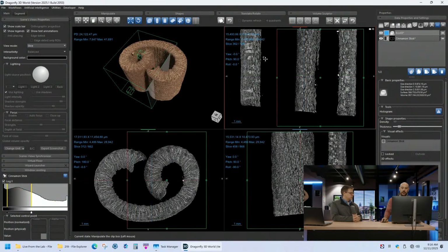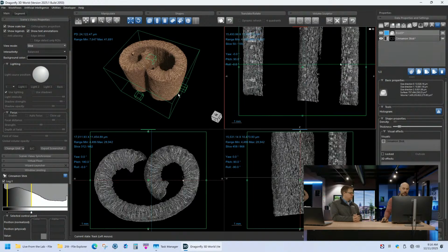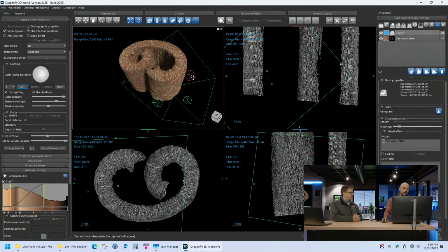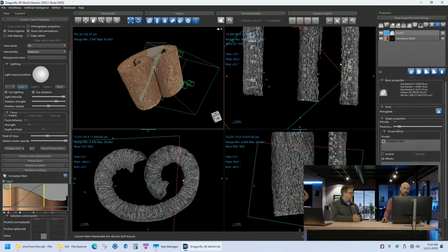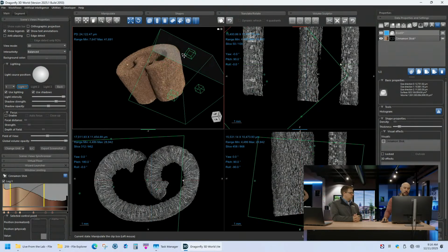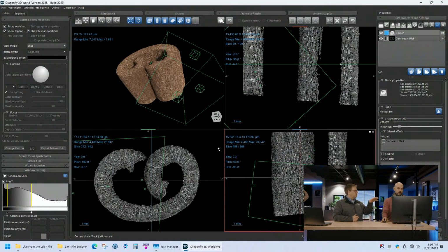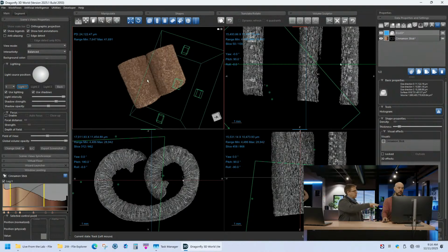And then we can command this box to do something. In 3D, you can see these nodes here, and you can see them in 2D as well. That allows you to rotate the box. Let's move it to a funky shape. You can do this in 3D as well, moving these planes. If you wanted just a slice, you can use the three views: the XY, YZ, and XZ views here. But if you want to make a more complex cut, now we can add this box.